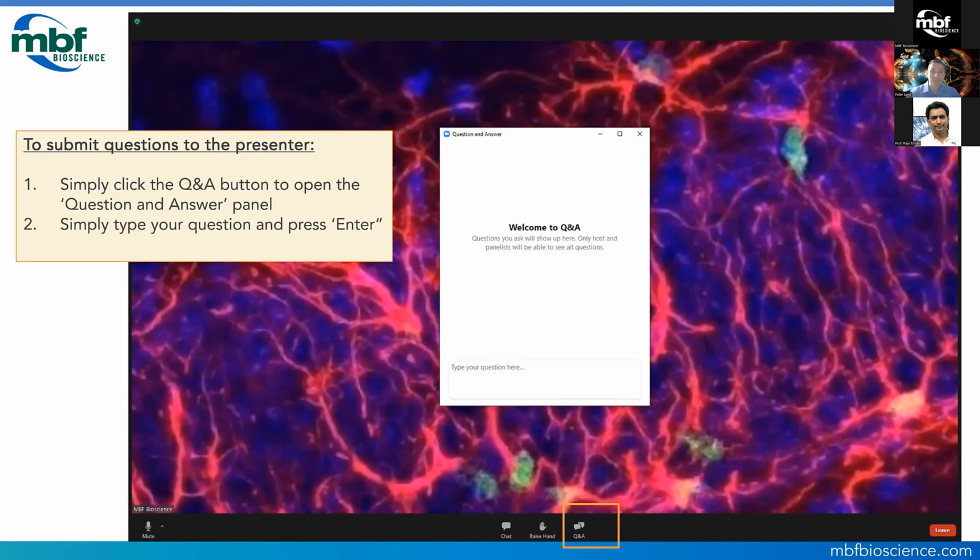Right, great, thank you. Let's see, we have a second question here. Have you used clearing protocols preserving endogenous fluorescence reporter signals, GFP, RFP, mCherry, or Rainbow?